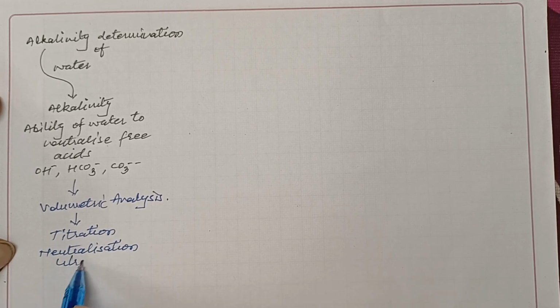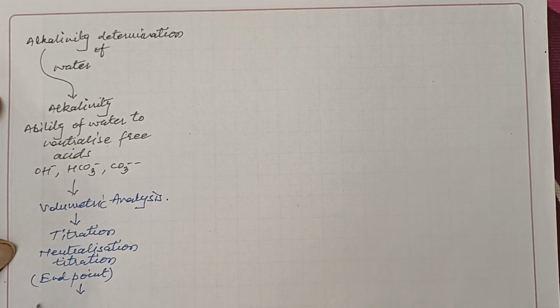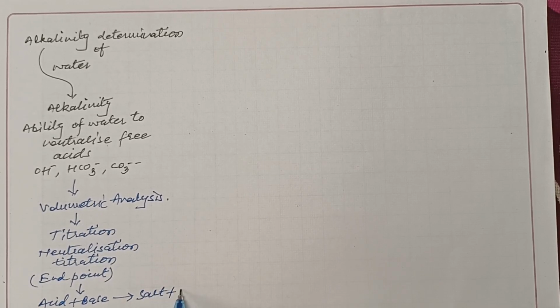This titration is referred to as neutralization titration because the endpoint detection, or coming of the endpoint, is due to the acid base reaction, a famous reaction in which salt is formed with some amount of water.